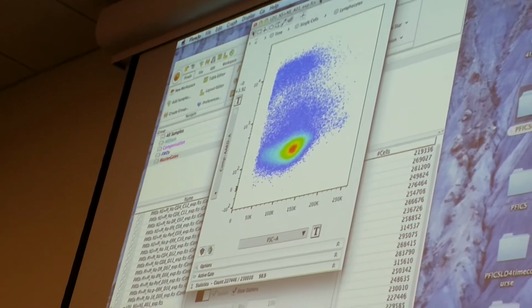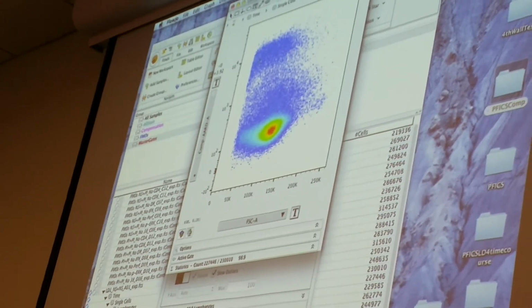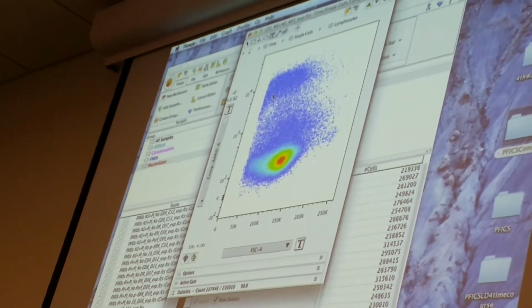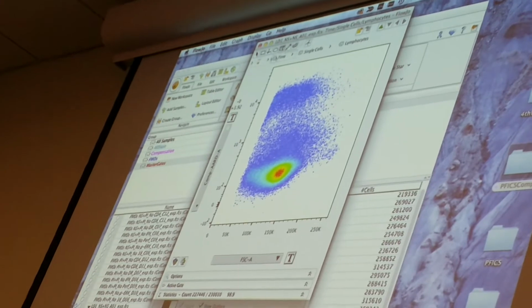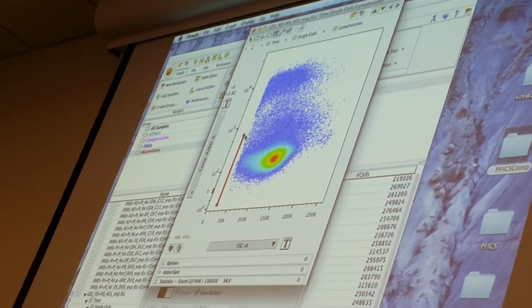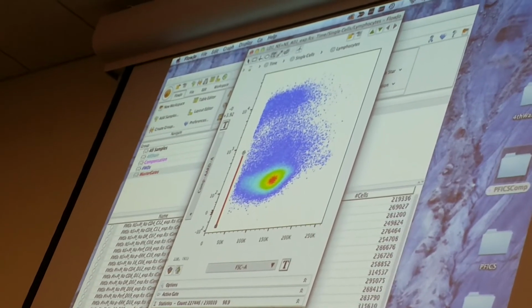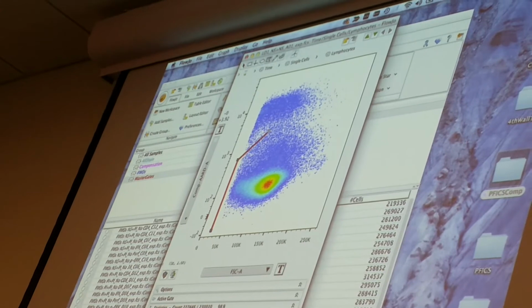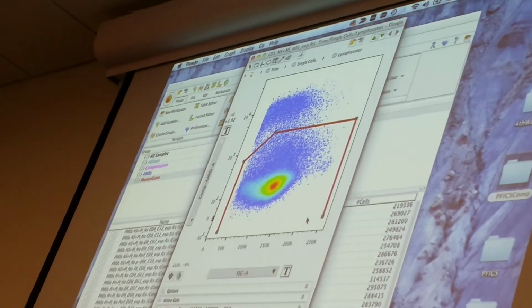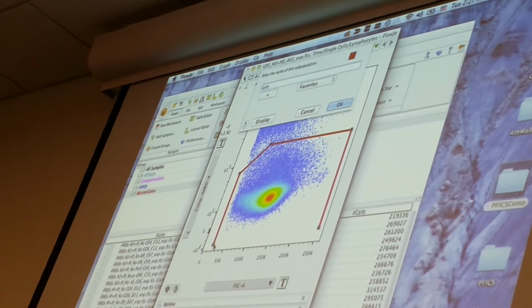Discriminating dye binds free amine groups, and so the dead cells are the ones that the dye gets into and binds everything. So they're right, I want to exclude those. Maybe I'll take my polygon tool here and do a nice gate. If I hold down shift, it gives me 45-degree angles, and when I click, it creates a point. So I can click, click, click, click, and close, and call this live.